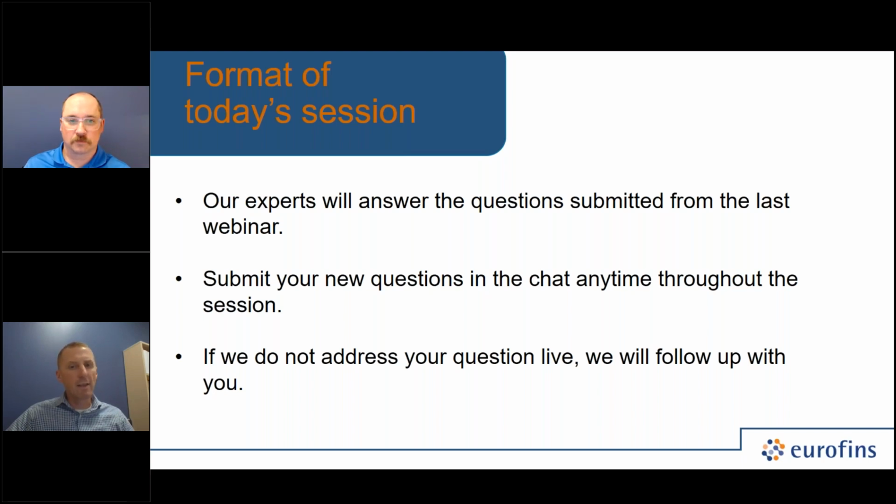Interesting. Yeah, it seems like there's a lot more work to be done in that particular area as the products become more prevalent in the marketplace or get introduced into the marketplace, in order to determine how we're going to measure postbiotics. But it also seems to depend on what the products are, which is really pretty interesting. Yeah, and really, it comes down to understanding the mechanism of action with how it's providing that health benefit.